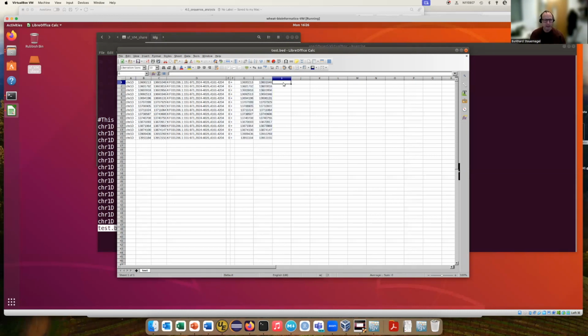And then in this column, this is now our item RGB column. Here we can enter RGB values. This is RGB for red, green, blue. If we have something on 255, this would be in that channel the full color, and if it's 0, it's none at all.